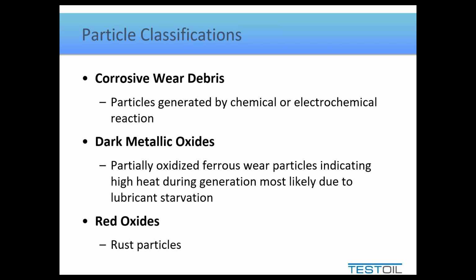That is usually a significant and severe form of adhesive wear, where two surfaces come under such great contact with each other, they actually temporarily weld to each other. And then as they tear apart, the heat that's generated usually anneals at least one of the metals, and you get these darkened particles. It's nasty. Nobody ever wants to see that one.